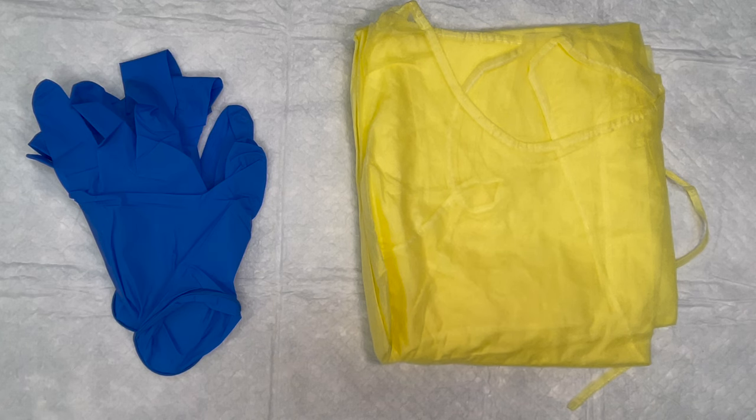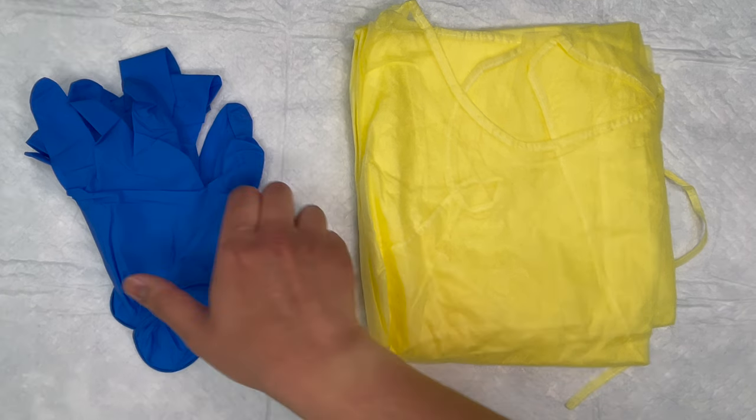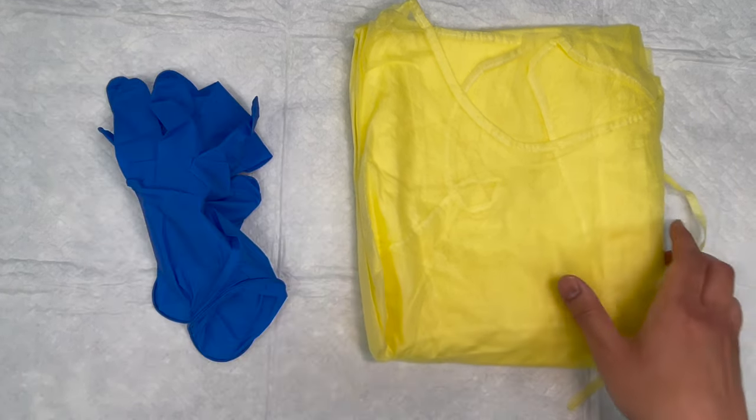Skill 8: Donning and Removing PPE, Gown and Gloves. The supplies you're going to use for this skill are a set of gloves and a PPE gown.